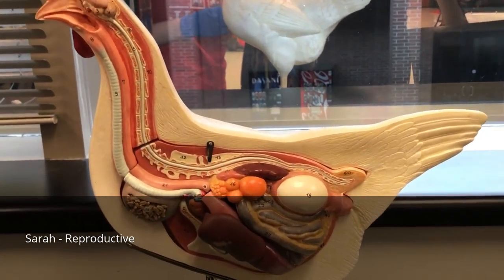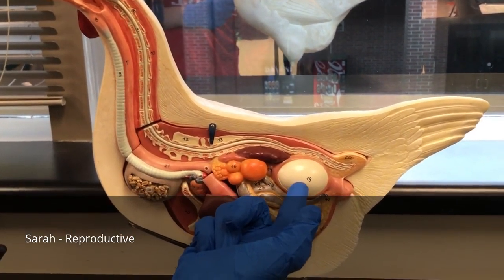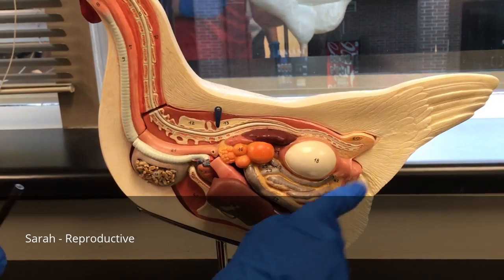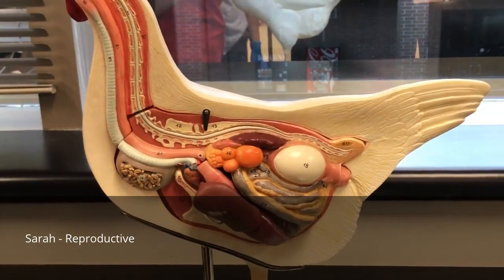Birds and pigeons have one ovary, and it's also small, which helps aid in flight. In the one ovary is where the egg is created. And they usually have hard shells, but not all birds. And the egg is then expelled through the cloaca, through its reproductive organs. And that's it.